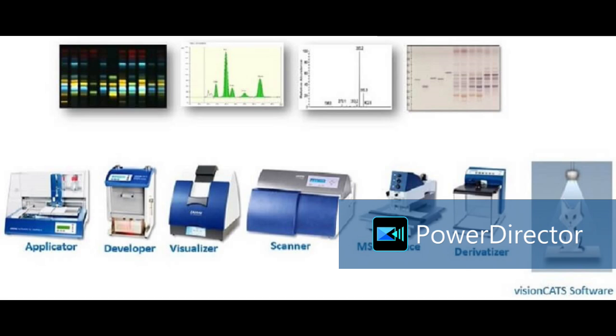Once you extract the sample, for example DNA, you put a drop over that, and there is an app there. Just select whether you want RNA content, DNA content, protein content, and then just press that. All other things are taken care of by the machine itself. Within seconds, you get the reading displayed on the monitor. So are such technologies available with this system?